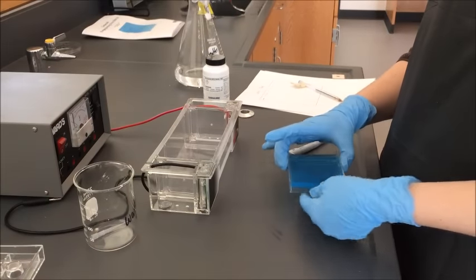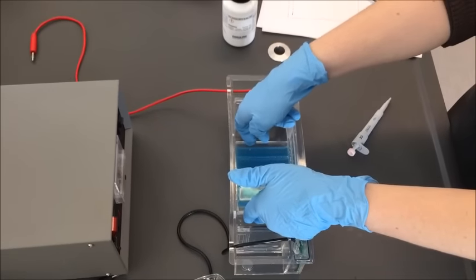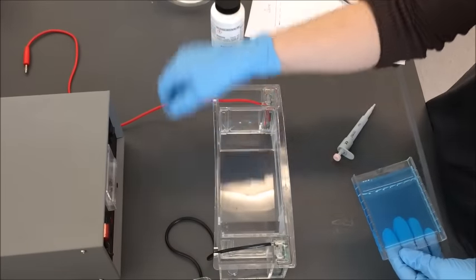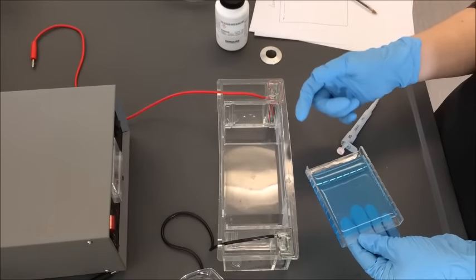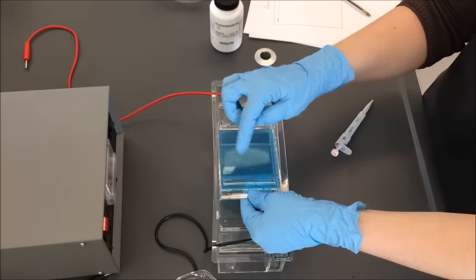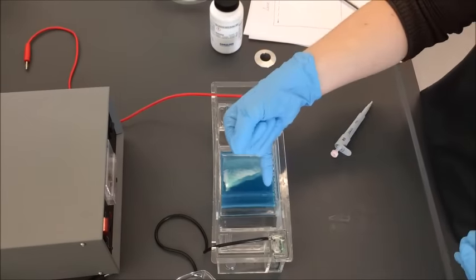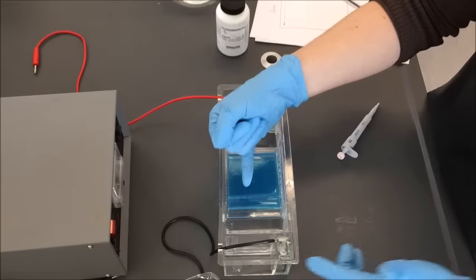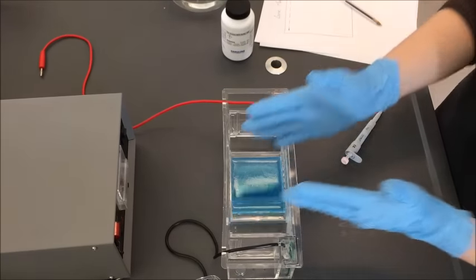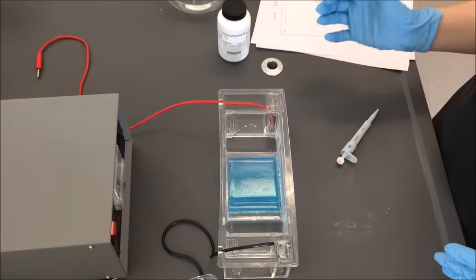Now that I have my bumpers off, I'm going to pick up my plastic container for my gel and lower it slowly into the chamber using the channels to keep the plastic mold in place. You'll have two different color leads coming off — a red and a black. DNA is negative, meaning it's going to run towards the positive. So I orient it so the DNA chambers face towards the black end, and the DNA runs towards the red or positive end.